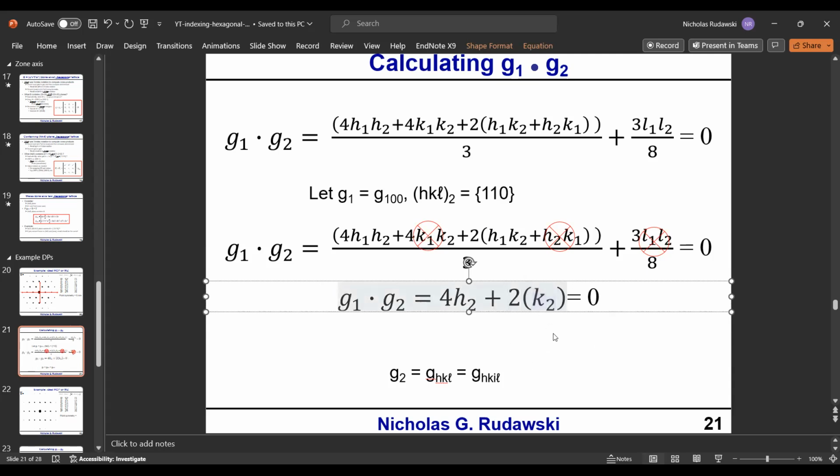Okay. So now we end up with that out. -1. Okay. And then let's simplify this again. So we're going to divide through by -2. So we end up with -2 here. Let's get rid of the parentheses just to clean this up a little.